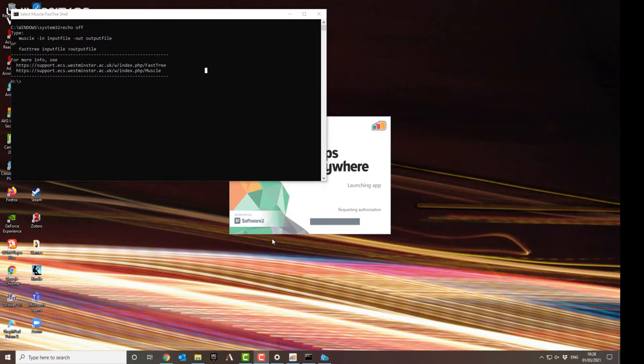FastTree and Muscle are command line programs, which means you have to type a command which will then be carried out. So the window that's been opened is an example of a DOS shell. This is how computers used to work before Windows, and it's a real throwback to those times.